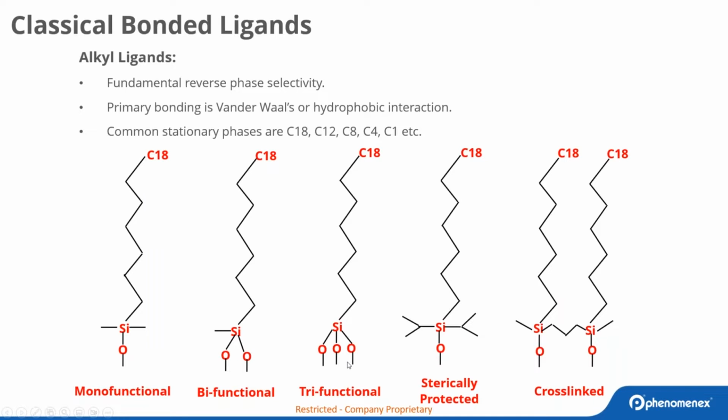Then you can also do trifunctional silanes, right? So you can do a C18 or a ligand bonded to trifunctional silanes. So this one can be done. Again, it could help use lower pH values and decrease the bleed, but they're harder to manufacture reproducibly. So they tend not to be used because they are more variable, right, from batch to batch.